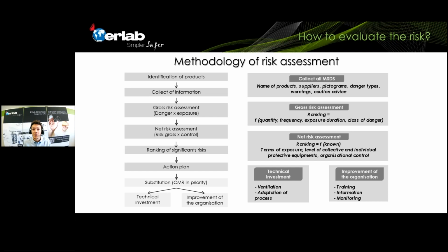It doesn't cost any money, but it's just a question of making sure that you give the right training to the people in the lab, that you give the right information, and then you monitor the safety equipment that's already present in the lab.